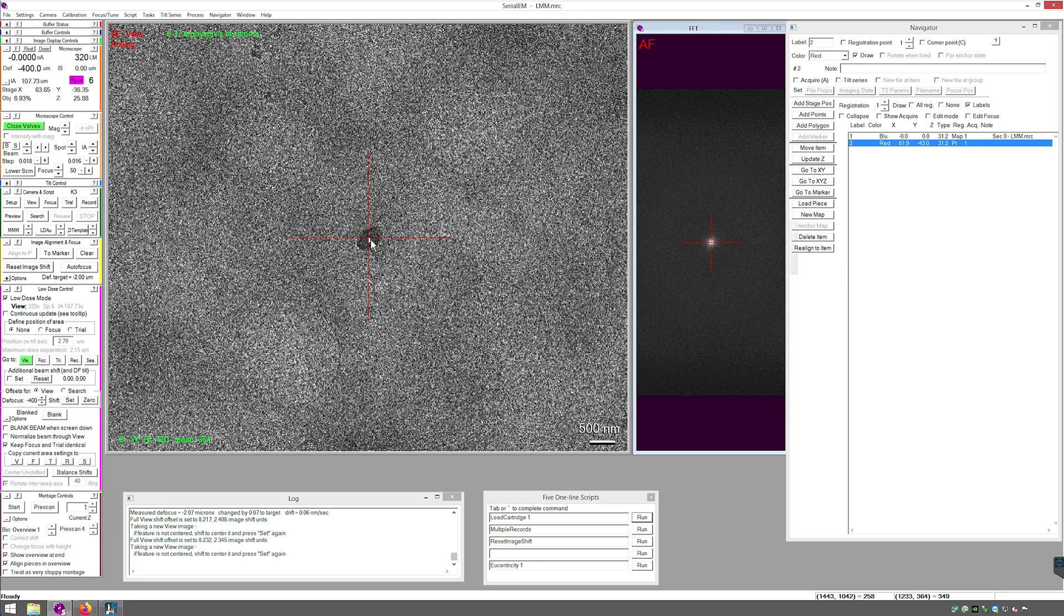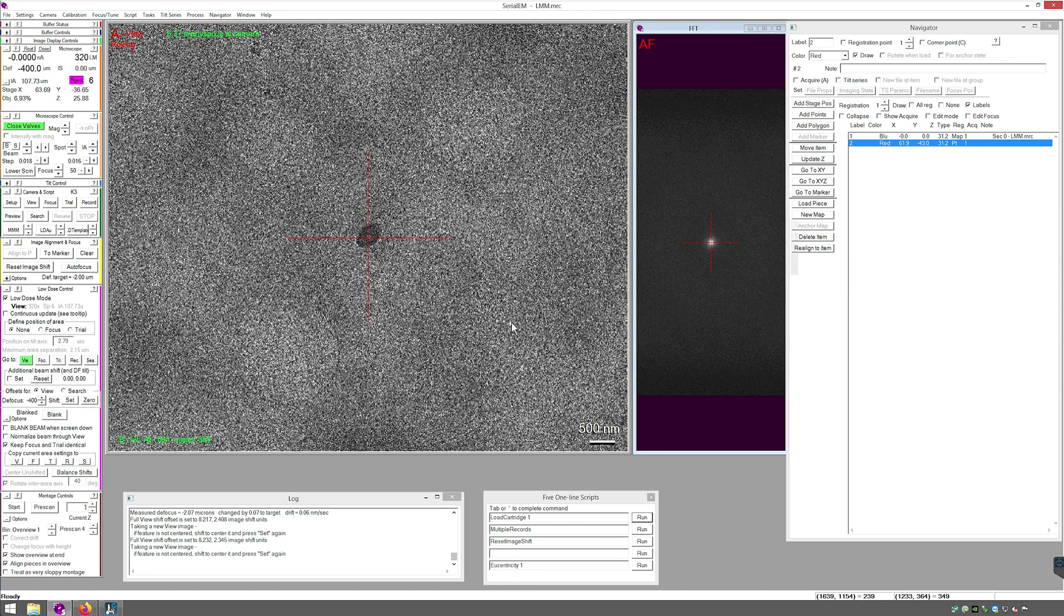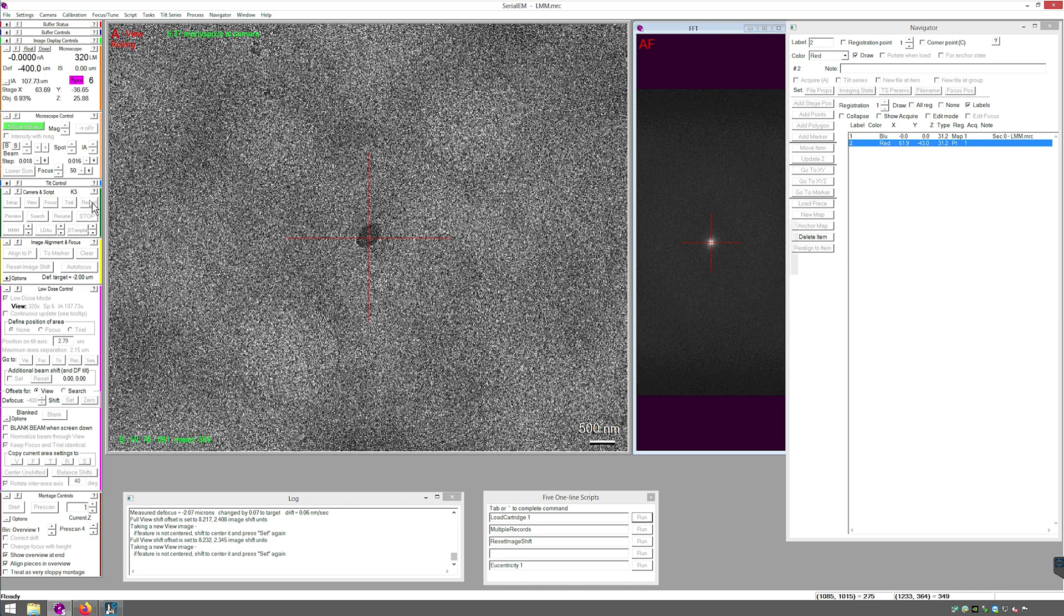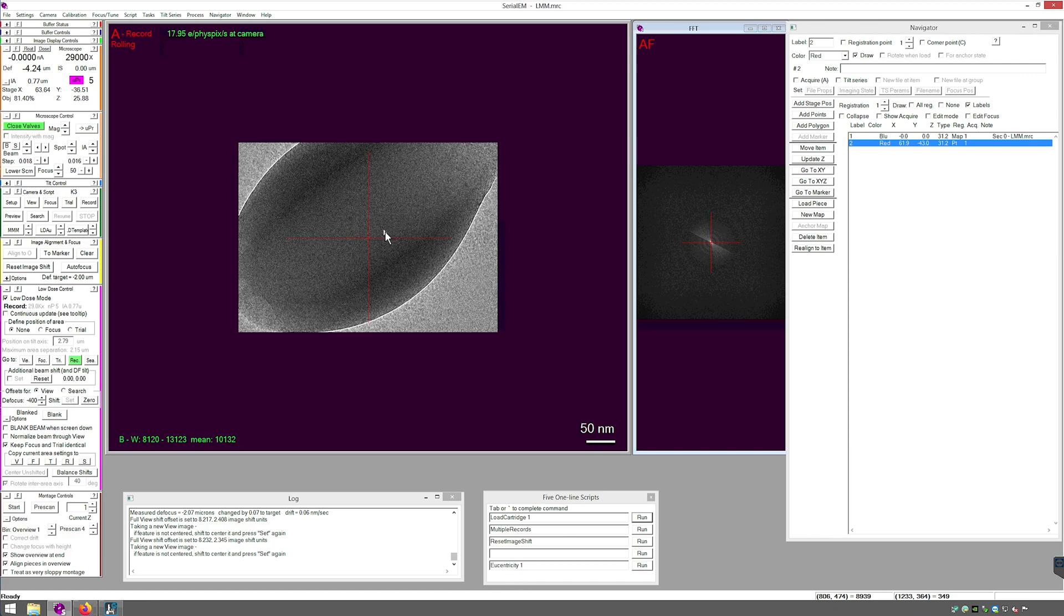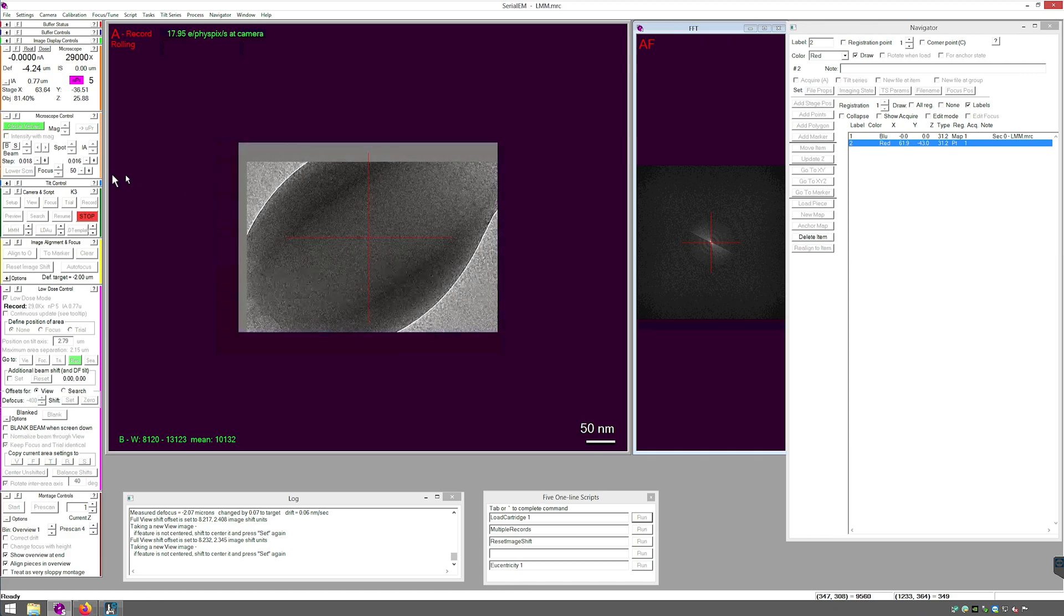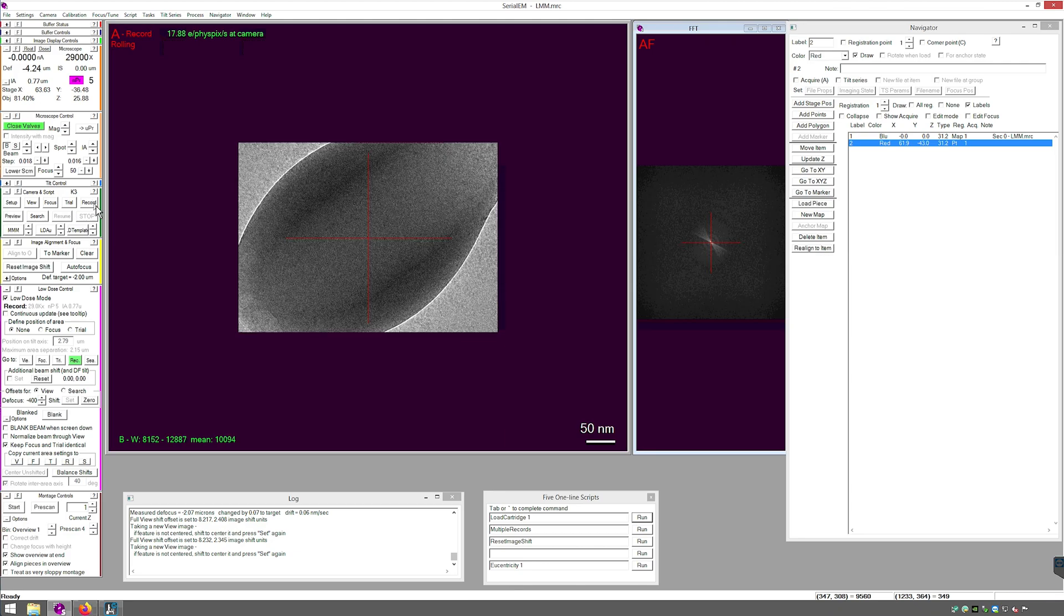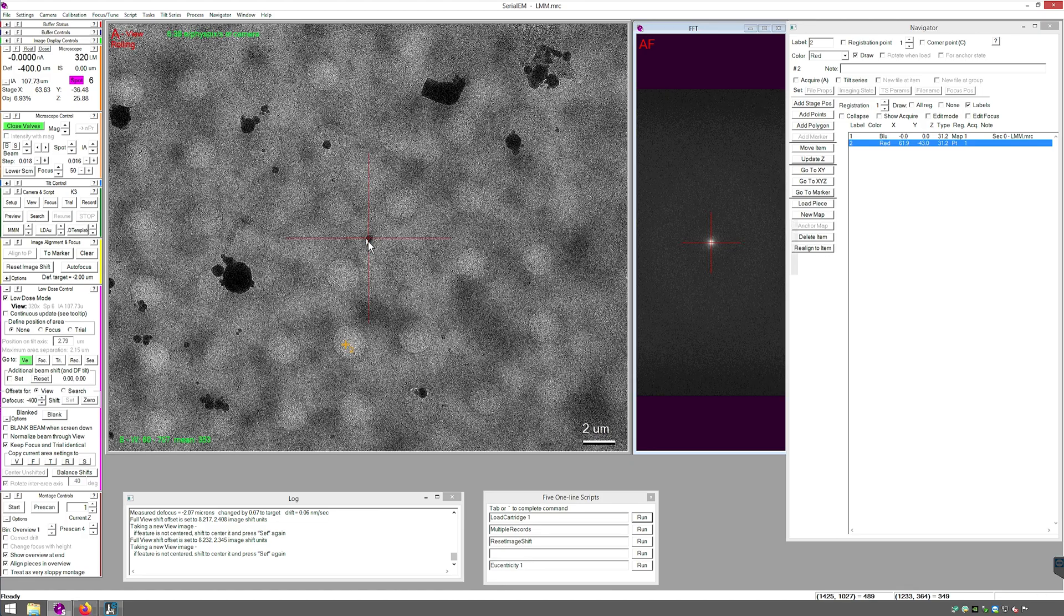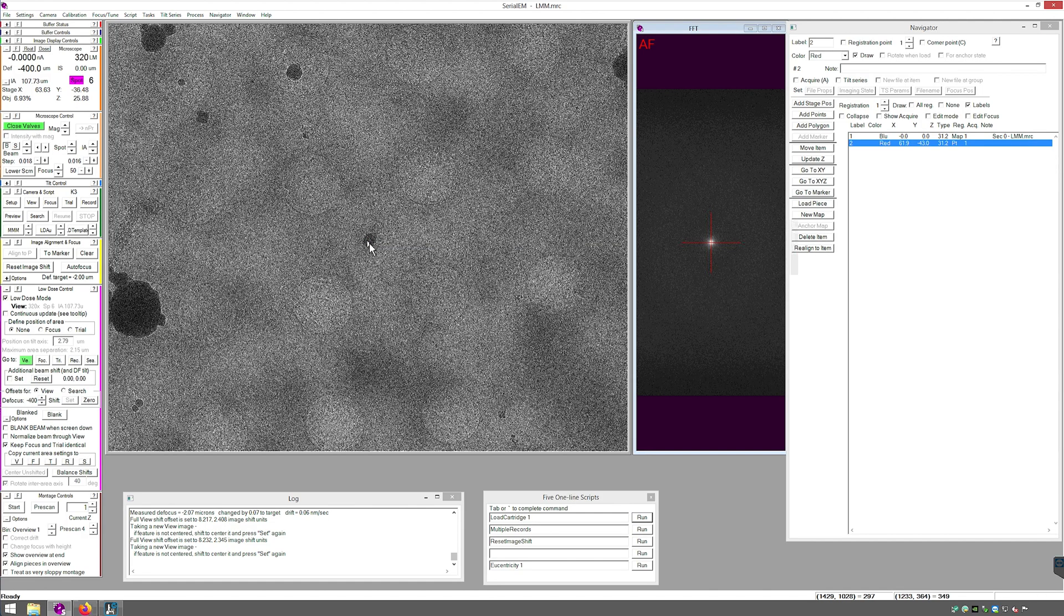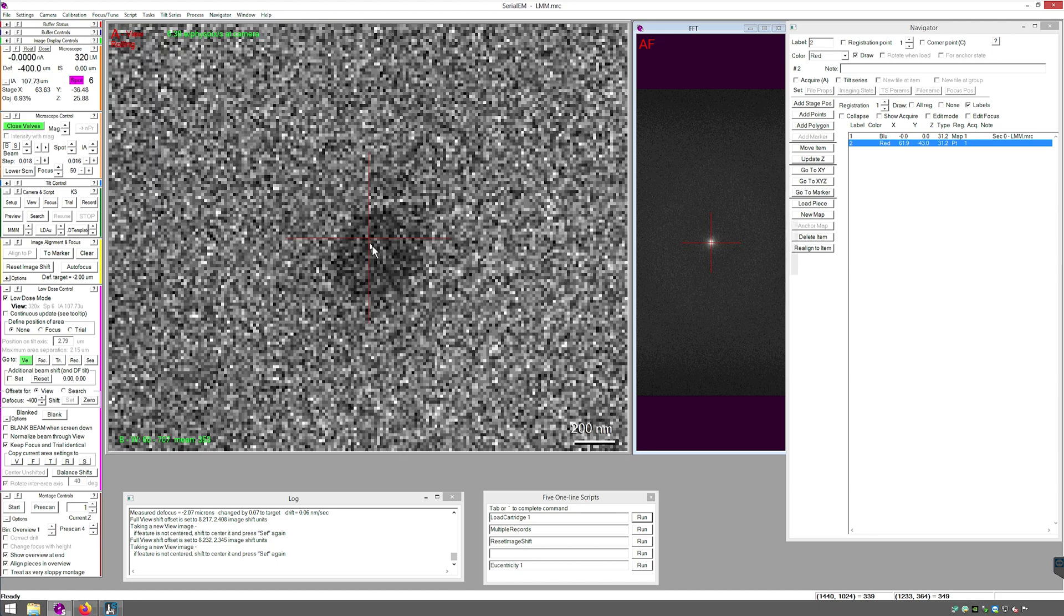I'll do a better job of centering it. And now record. And that is pretty well centered. Maybe I'll just do an extra job. And now view. And I can do a fine calibration. And there it is. Pretty well centered.